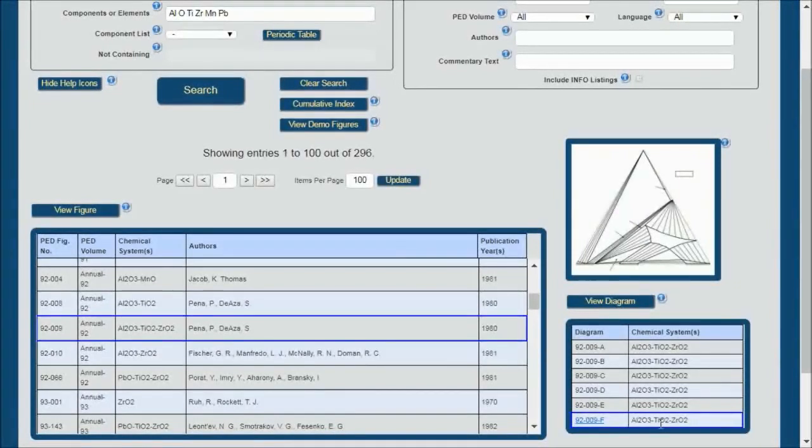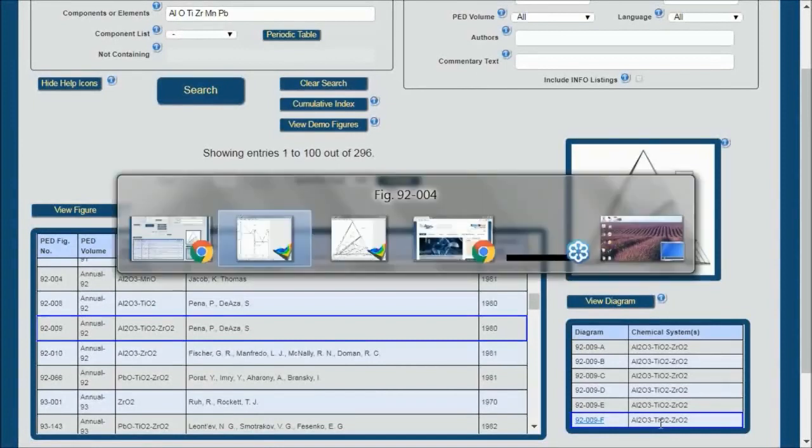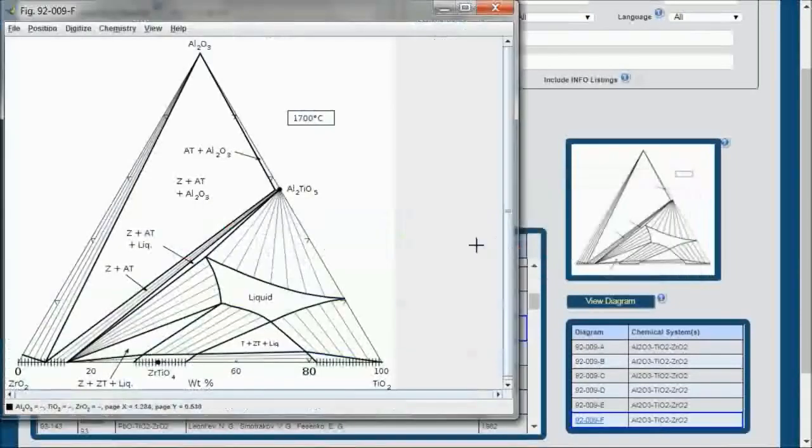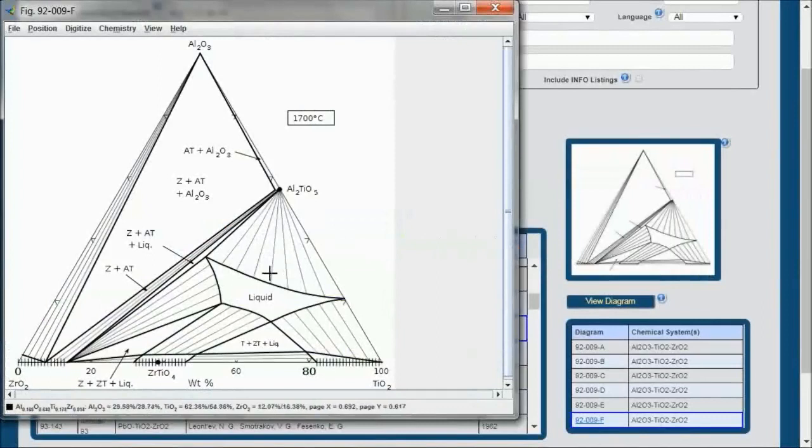Now let's take a look at how the PED software handles a ternary diagram. On a ternary diagram, there is no temperature. So the PED viewer software gives you the values for the three compounds that make up this phase diagram. At this point, you can see that alumina is approximately 23%, titania is approximately 56%, and zirconia is approximately 20.5%.